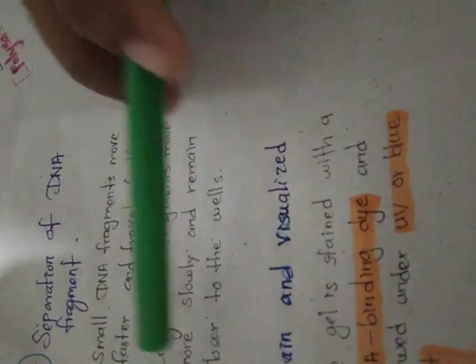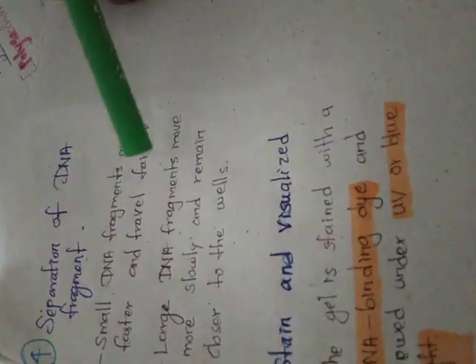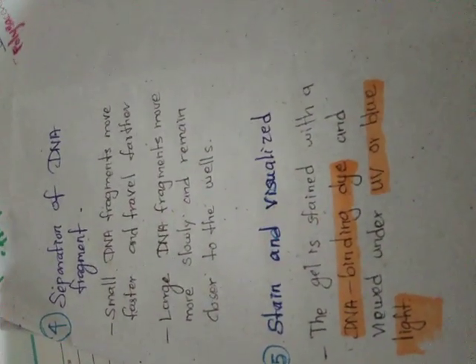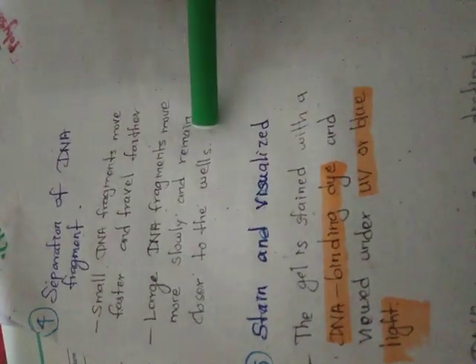Small DNA fragments move faster and travel further. Large DNA fragments move more slowly and remain closer to the wells. So we know the big ones can't move easily, no. For example, take humans: a thin person can walk a greater distance than a bigger person.